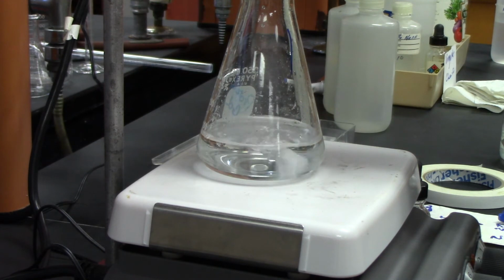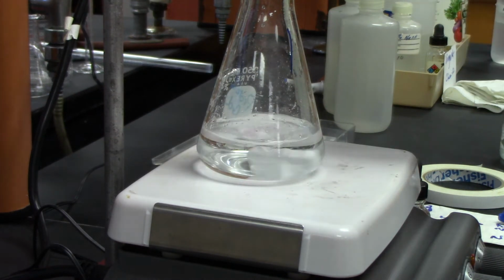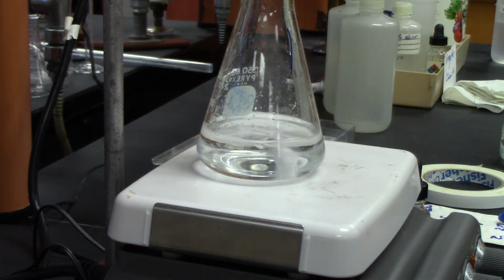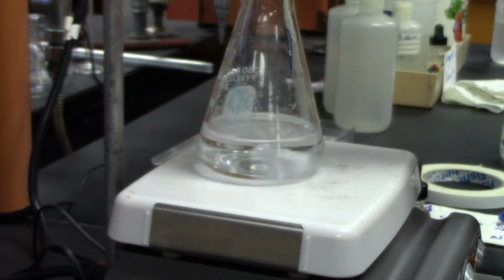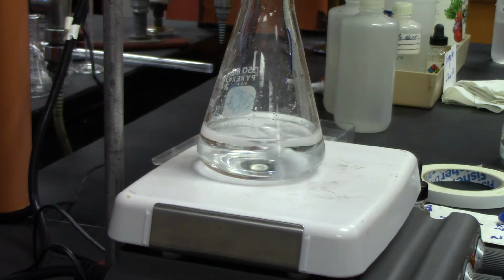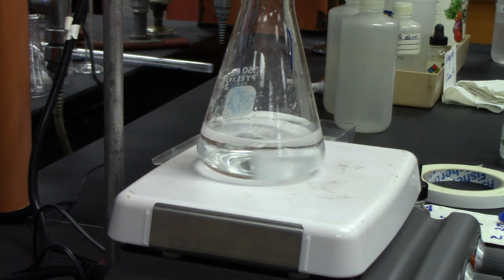Hopefully it's going to change soon. It's starting to worry me. We're going to have a problem here. I need to add more sodium hydroxide, so I'm going to let it go down to 50. I can stop now if I want to, but it still hasn't turned pink. It's at 50. So what I have to do is add more sodium hydroxide. I'm not going to add it all the way to the top here.